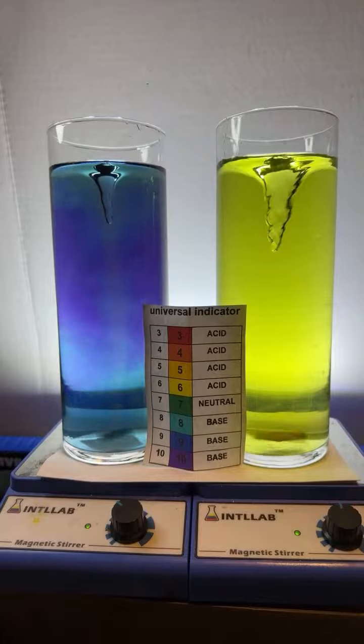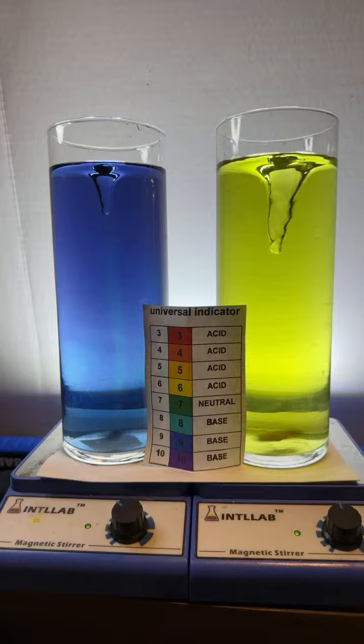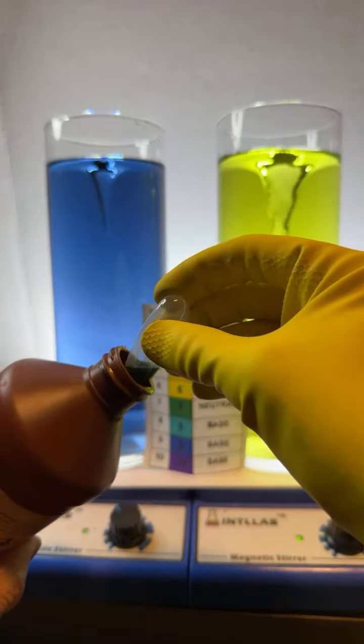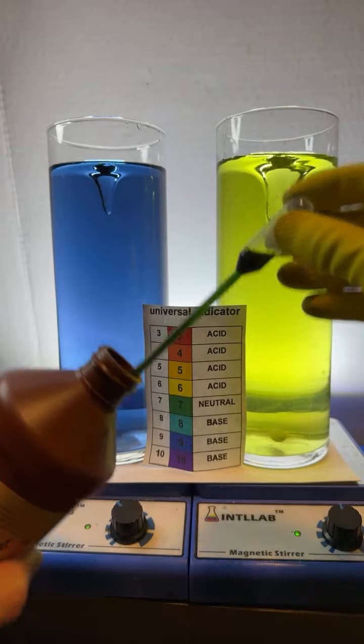Is a universal indicator itself an alkaline, acid, or base, or neutral? Here, I'll show you. We can figure it out ourselves. So I'm going to go ahead and get some universal indicator. I got to make sure I put this in a fresh, unused dropper. All right. Pay attention to these values here. We're going to look at the color of universal indicator straight out of the bottle. And you can see for yourself, it's green. So the universal indicator itself is going to be neutral.